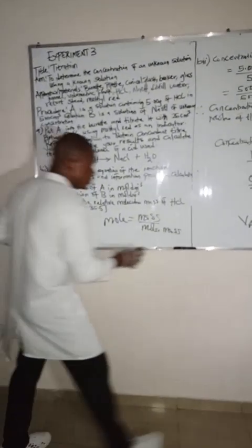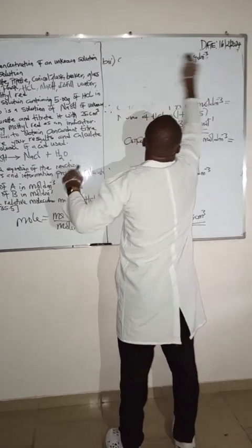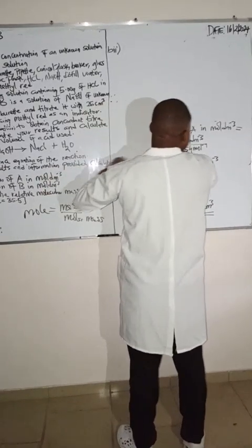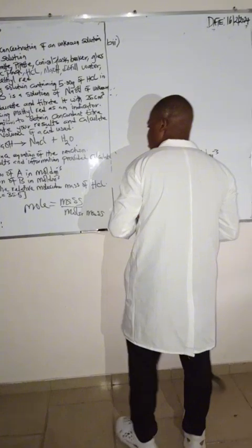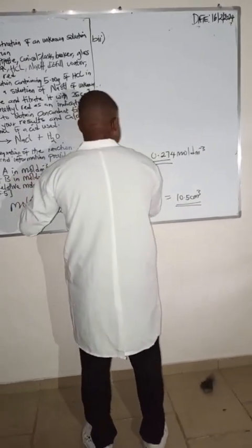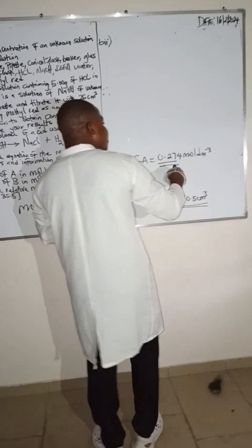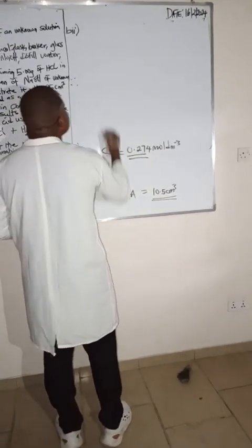Yes, sir. This is our CA, 0.274 mole per dm cube.